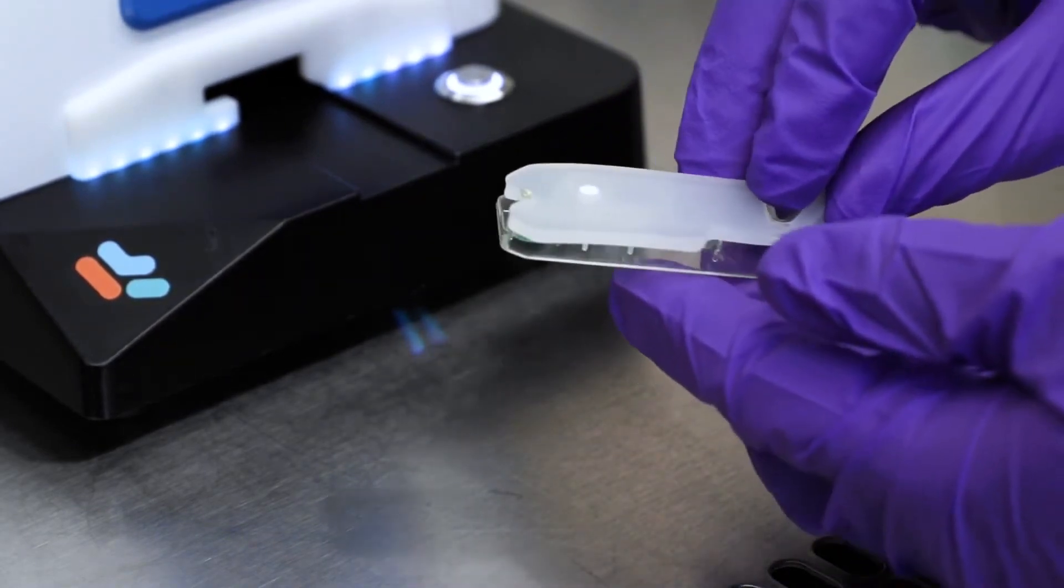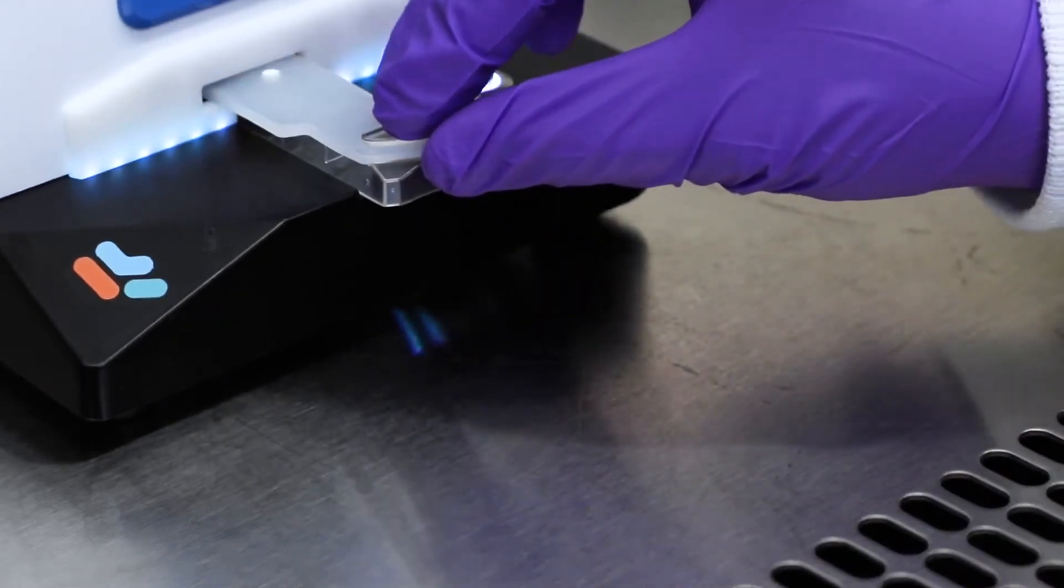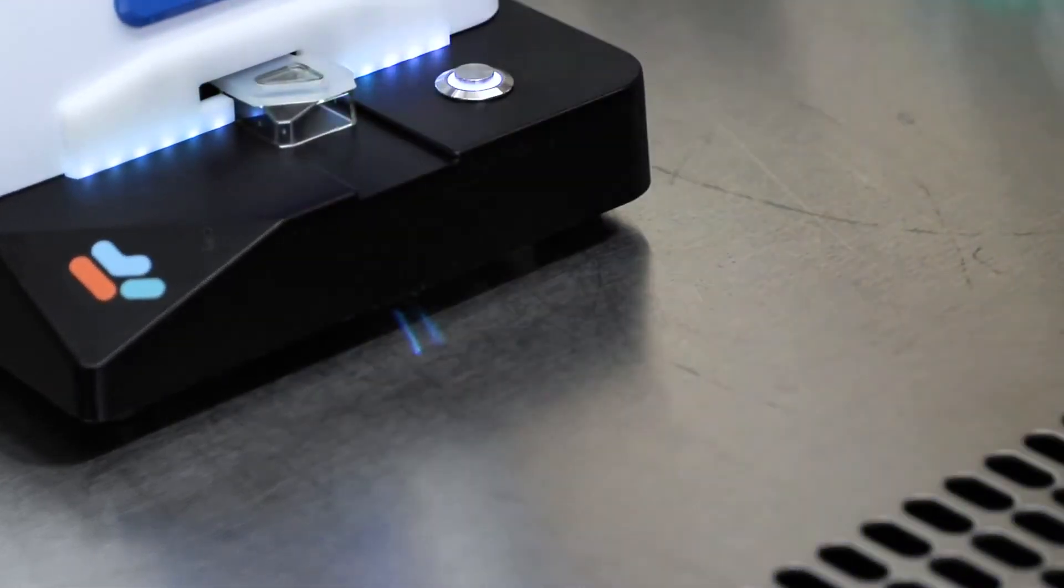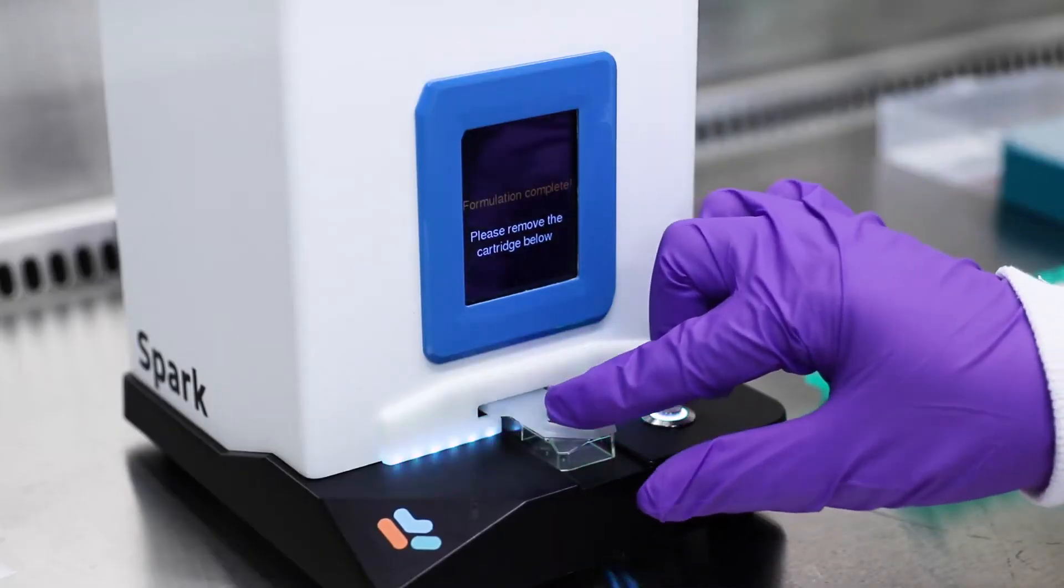The Spark enables formulations at volumes from 50 to 250 microliters, encapsulating a few micrograms of RNA with minimal waste and takes less than 10 seconds to formulate.